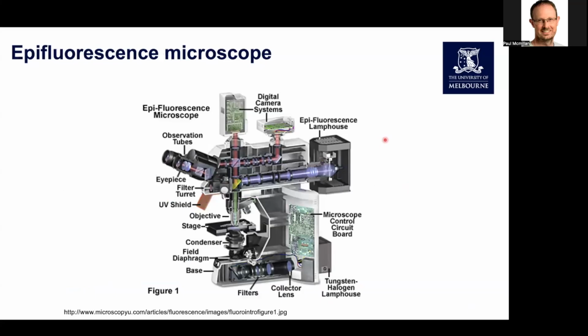All right, so let's start with this wide field microscope. And this, if we were to take a chainsaw down the middle of a microscope, this is what it would look like. If you're going to do that, please don't do that on any of our systems.